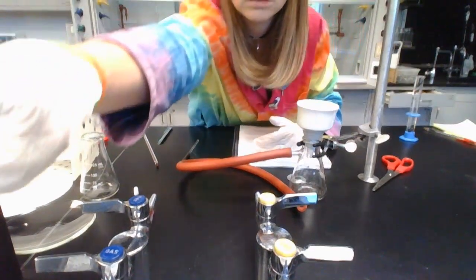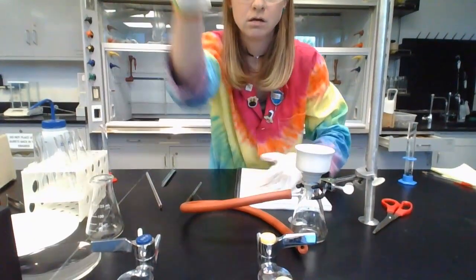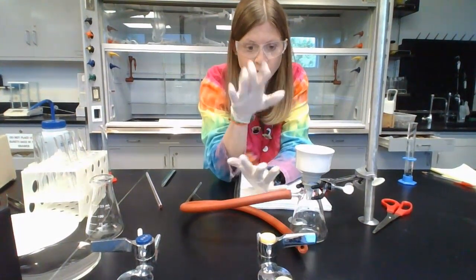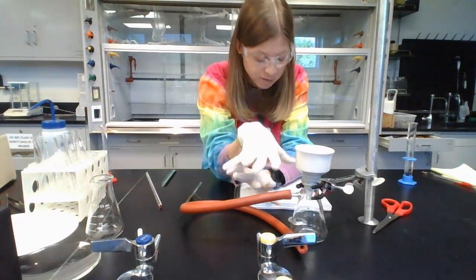We're trying to dry this as much as possible. We want to get all the water and other chemicals off of it. So we're letting the vacuum just pull liquid out for 5 minutes.